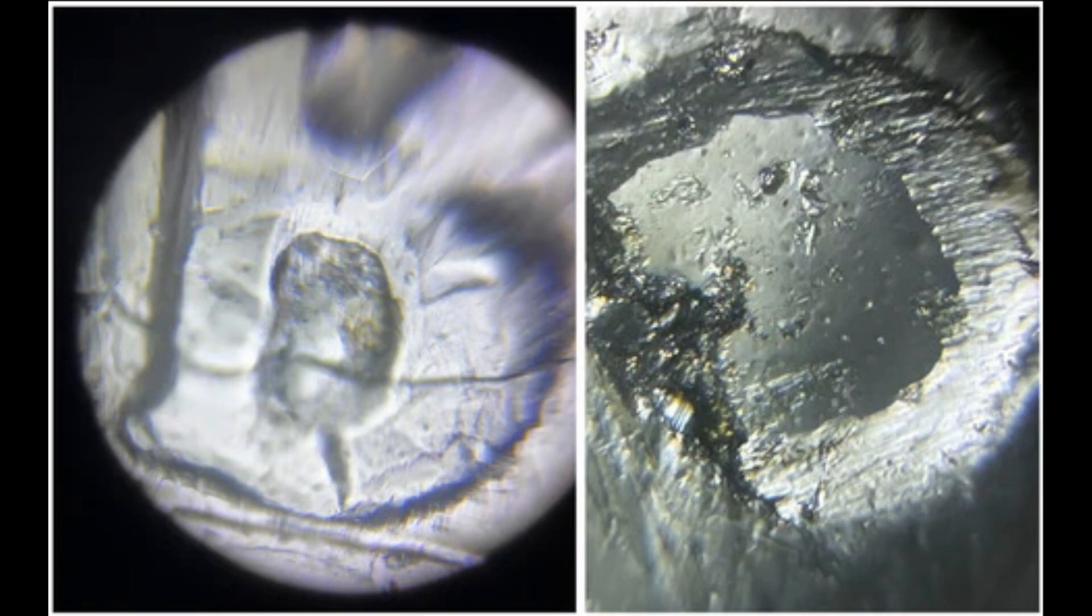This picture shows the impression of the letter B in the word Liberty from a U.S. nickel seen at 140x magnification. The next picture shows the inside of the bottom of the letter B at 140x magnification plus the 5x zoom on a phone. The extra magnification makes it look as deep as a cavern.